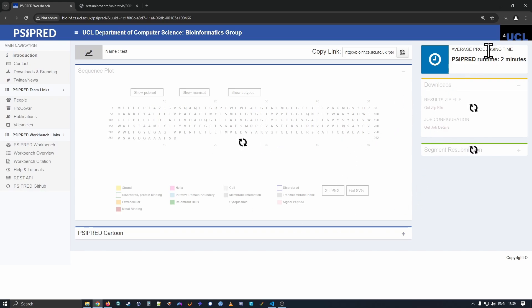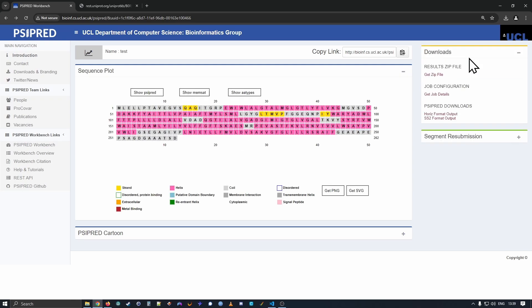Importantly, up here in the top right, we have a little panel that tries to give you an estimate of the runtime for the job. Cypred jobs are typically quite quick. So then we've seen this job. The analysis has completed already.